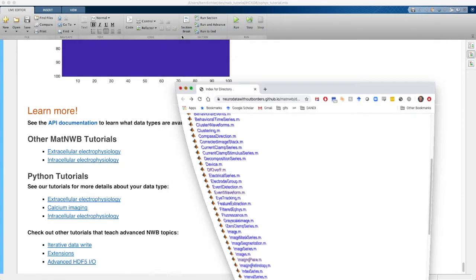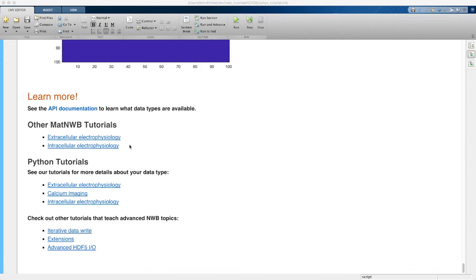I also want to direct your attention to other tutorials that are available. If you want to continue using MatNWB, there is an extracellular and an intracellular electrophysiology tutorial. We also have tutorials for PyNWB and Python, and we have tutorials for advanced features within PyNWB: iteratively writing data, writing extensions in PyNWB, and advanced I/O, which helps you fine-tune control over how the data that you're writing is expressed on disk.